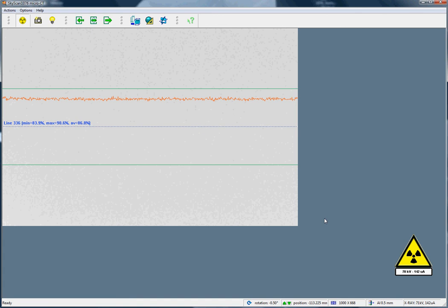One note of caution on this, however. When you first turn on your X-ray source, it can take a number of minutes for its output to fully stabilise. So make sure the source has been on for, say, 5 minutes before taking your flat field correction, rather than taking it immediately, so that the source is stable when you take the flat field.